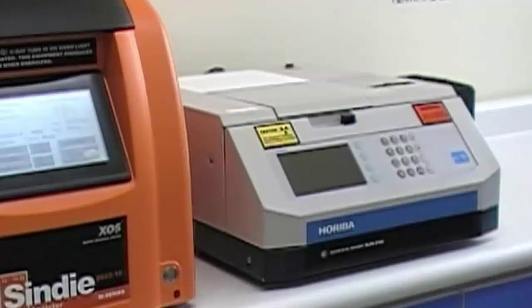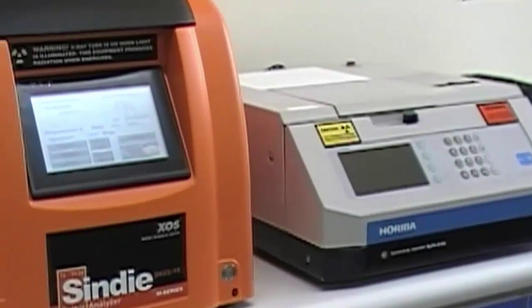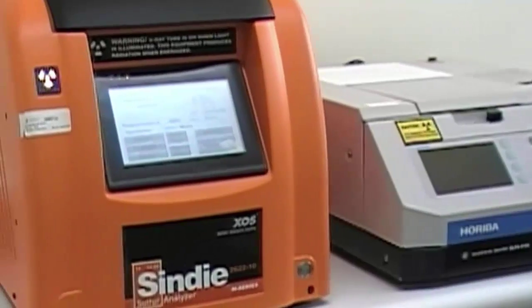Materiales de Referencia, Instrumentos y Calibraciones offers our consumable range of sulfur analyzers equipment which we present and demonstrate its use.